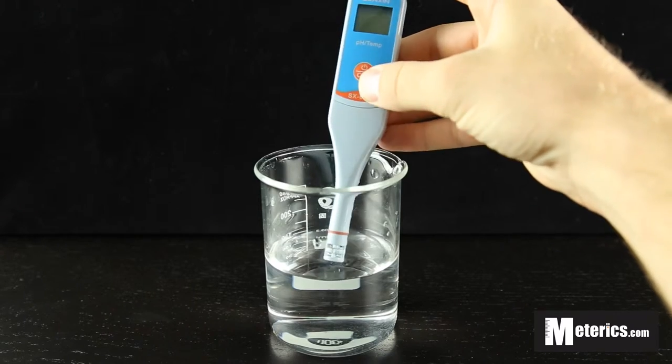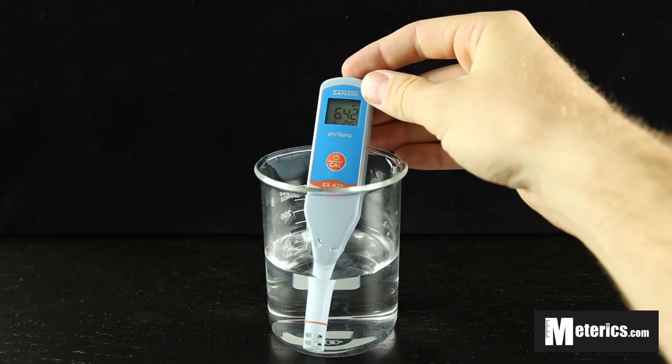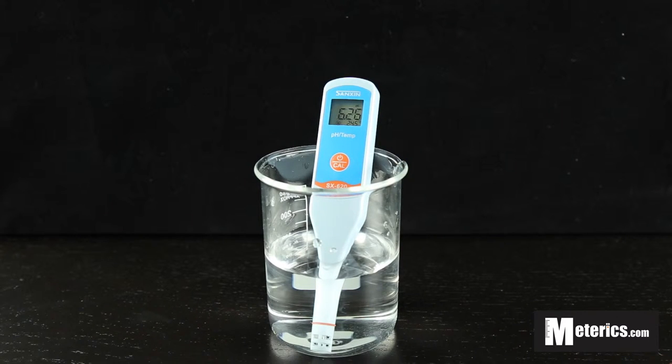So to get started, all you have to do is turn this on, then submerge the probe in whatever solution you're going to be measuring. Today we're just looking at tap water. Once you've submerged the probe, you want to wait until the pH reading stabilizes a little bit. Sometimes it can take a few seconds.